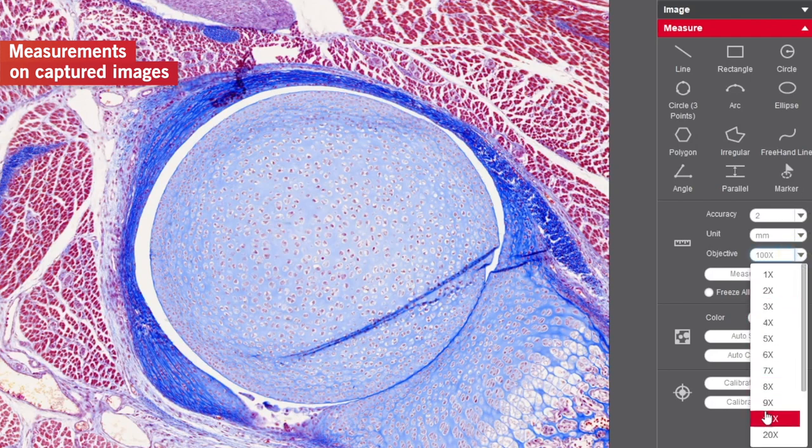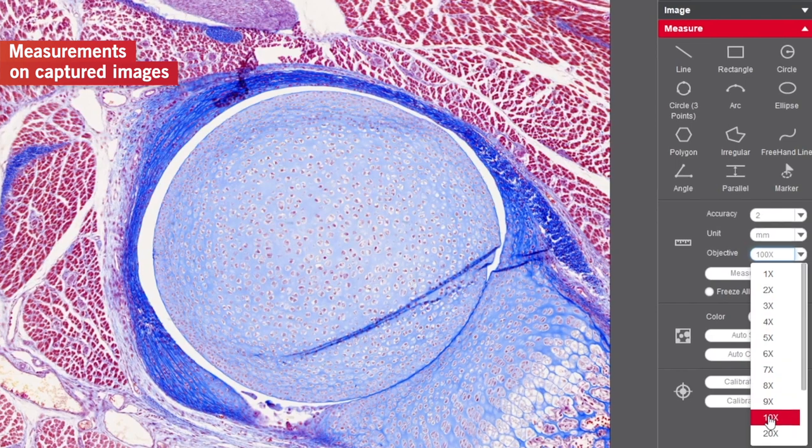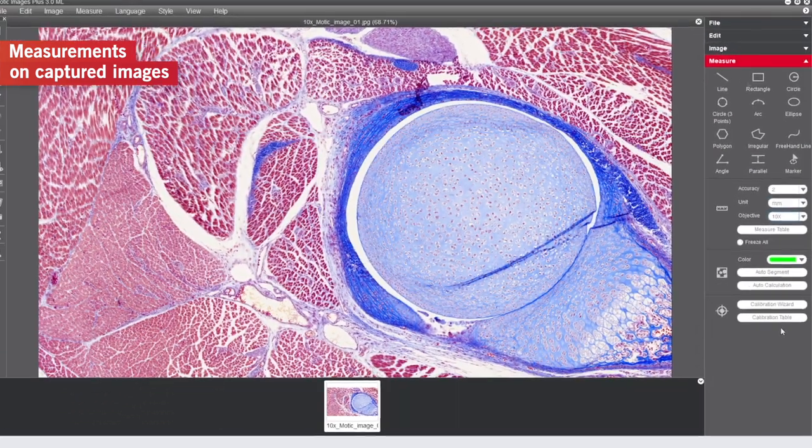In this case, you won't see the name of the calibration you set on the Motic Image Live module, but only the value, in our case 10x.